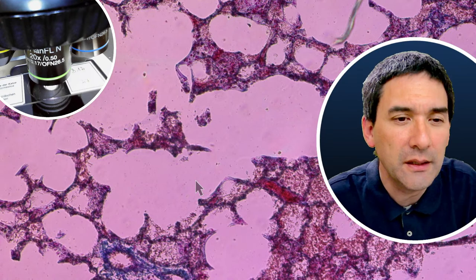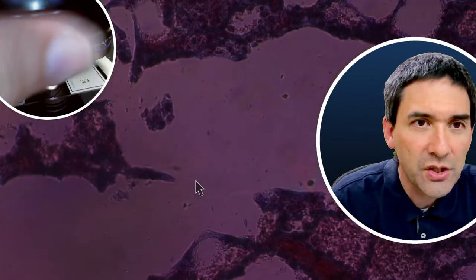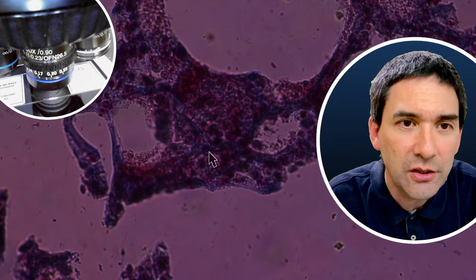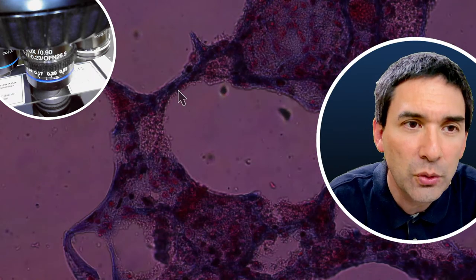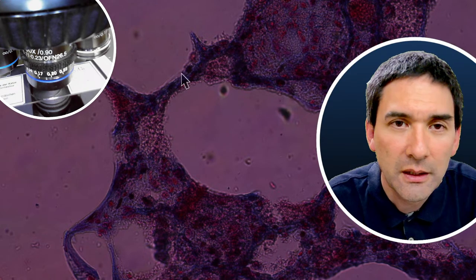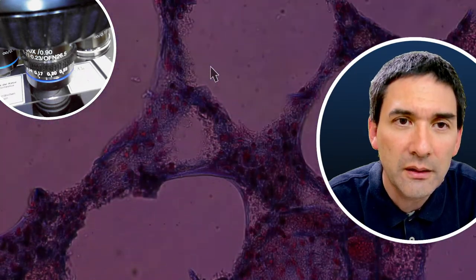They are epithelial in the lung. Yes. Basically, the epithelial cells are those that line the surface. So epithelial cells you would actually find primarily not in the center here, but lining the surface. They're kind of difficult to see over here, but these would be the cells lining the surface of the alveoli. These are usually flat, thin cells that basically allow for easier gas exchange.